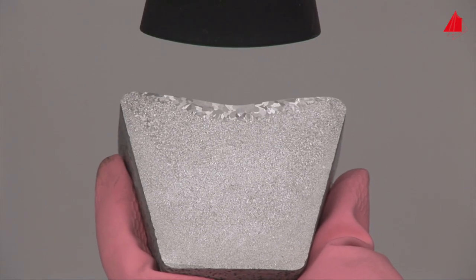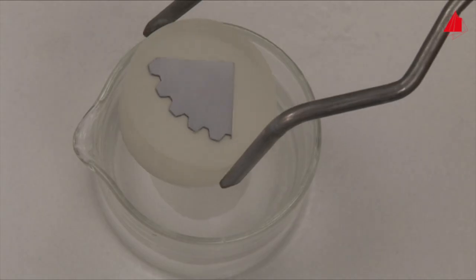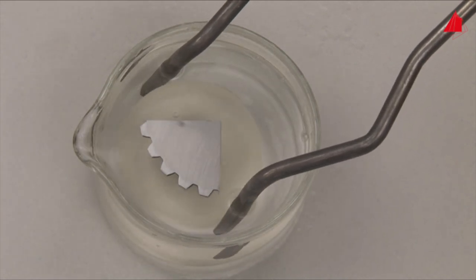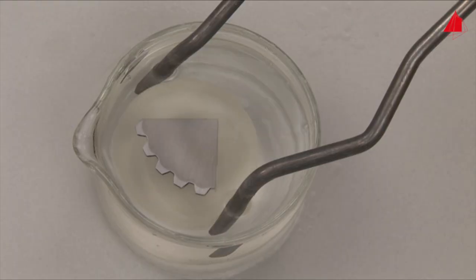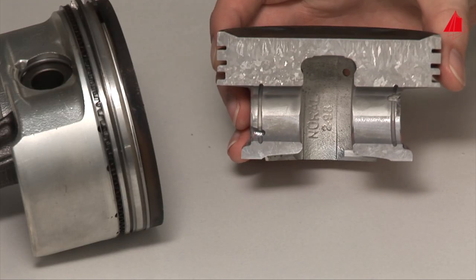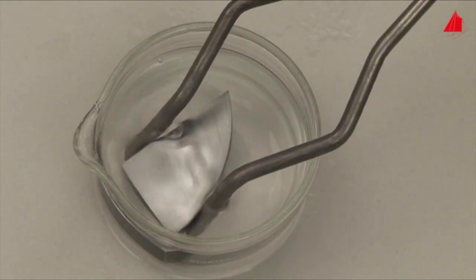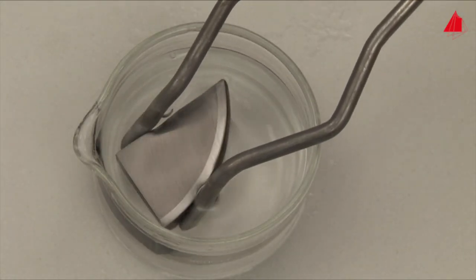Metallography gives an answer. In this video, we would like to introduce the macroscopic techniques of metallography. Macroscopic means to investigate a workpiece over a comparatively large area. Doing this, only little or no magnification is required. Often the naked eye is sufficient to examine the material.